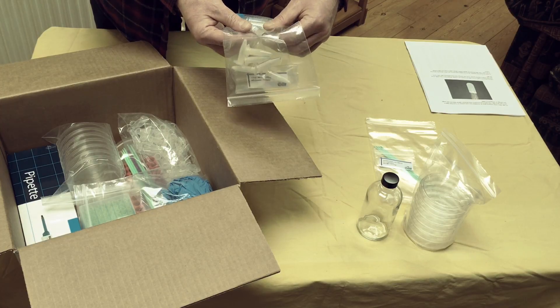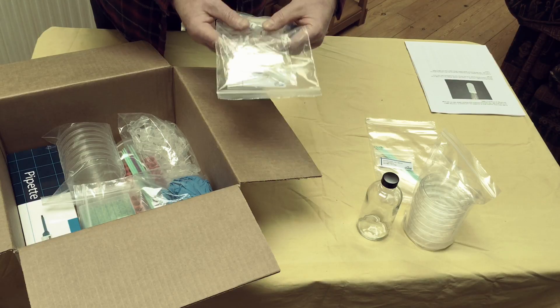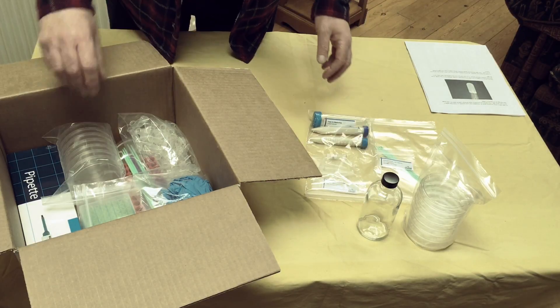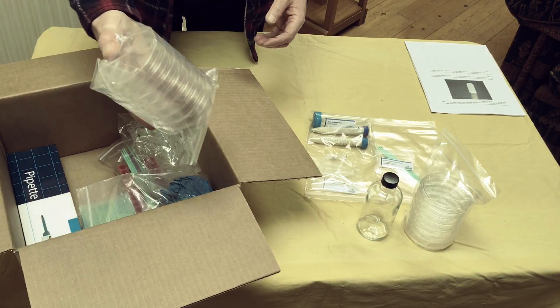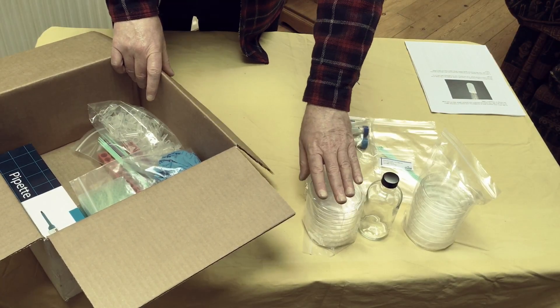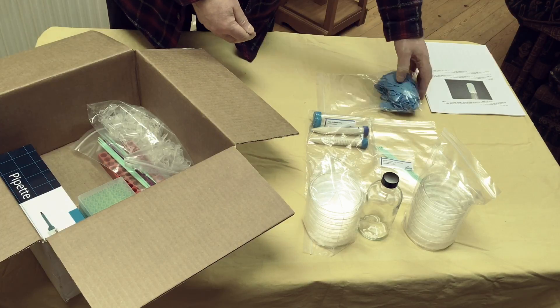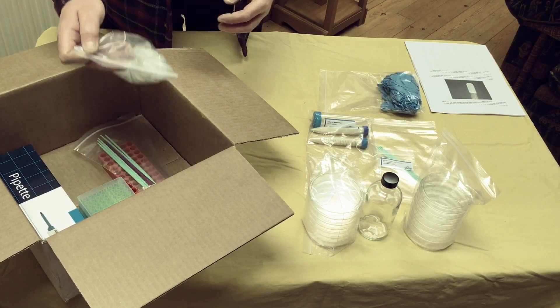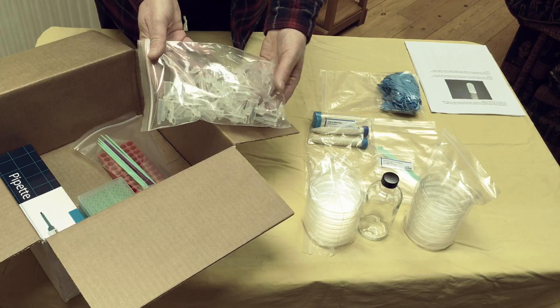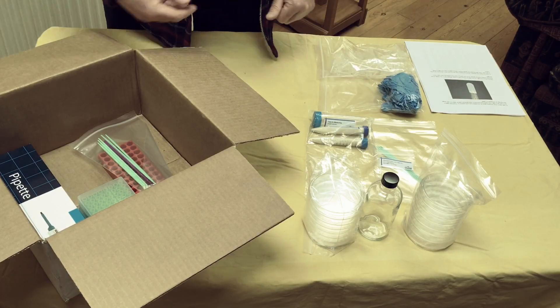This is the bacteriological transformation mix with lids on.